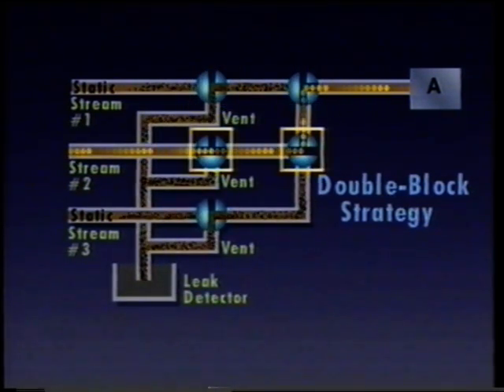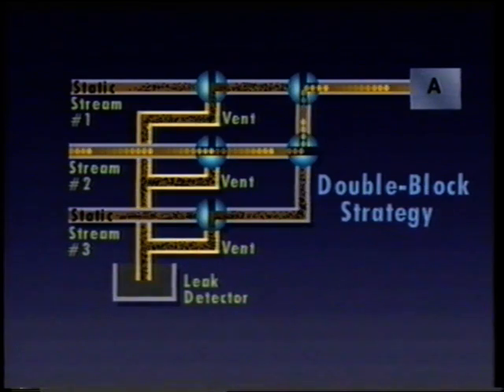Parallel valves are used for each sample stream. The tubing between the two valves is vented, and a secondary bypass is used to clear all the sample lines. As you can see, the samples not being analyzed are diverted through the bypass rotometers and are either returned to the process or vented to flare. The continuous flow ensures a current sample is always available for the analyzer. Meanwhile, both valves are open on the sample stream that is flowing to the analyzer.